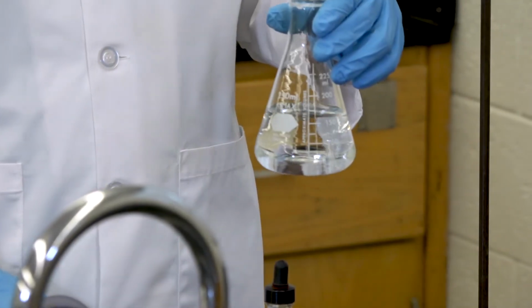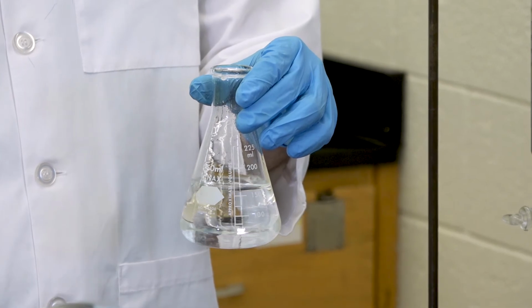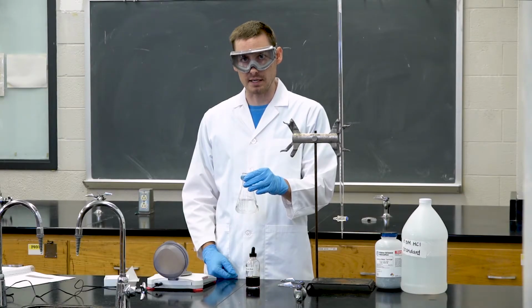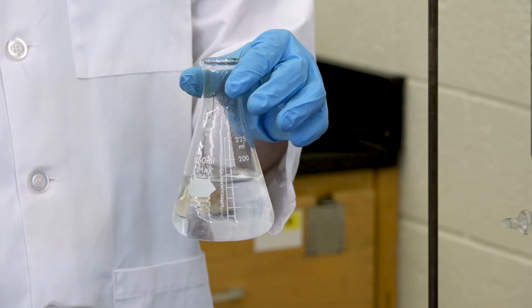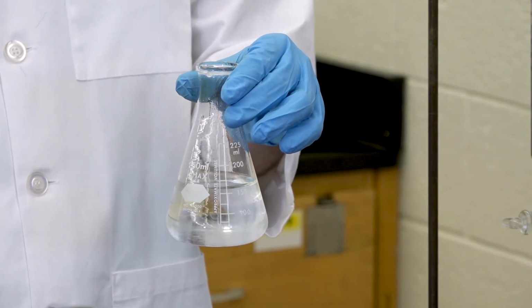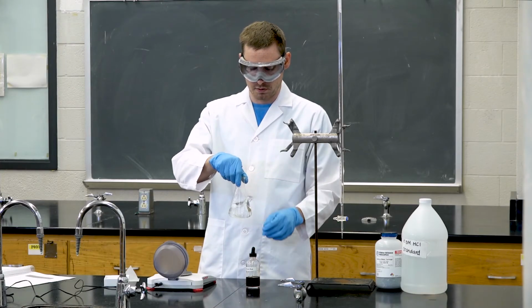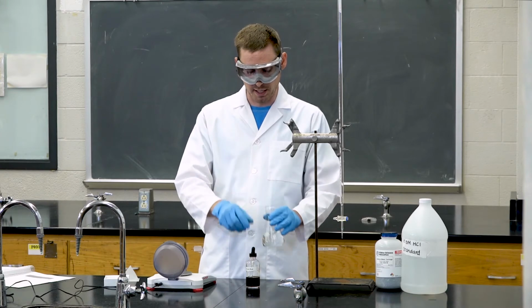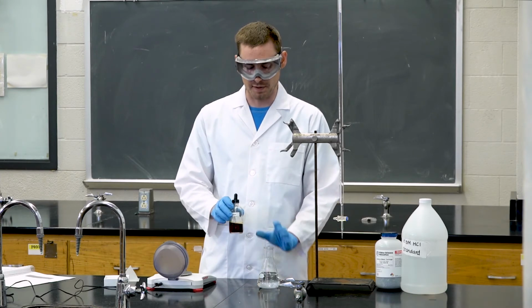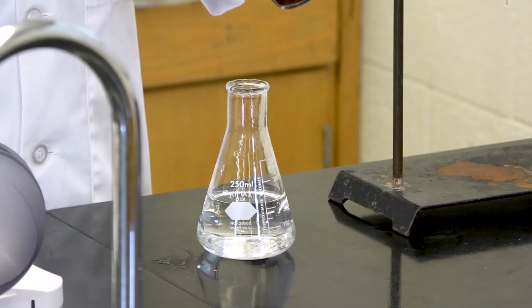Like before, this will produce a reaction where it produces hydrogen gas and calcium hydroxide. You'll need to wait until the reaction has stopped and all of the calcium metal has been consumed before proceeding with the titration. So once all of the calcium metal has been consumed, we can then add 10 drops of thymol blue indicator to the Erlenmeyer flask.